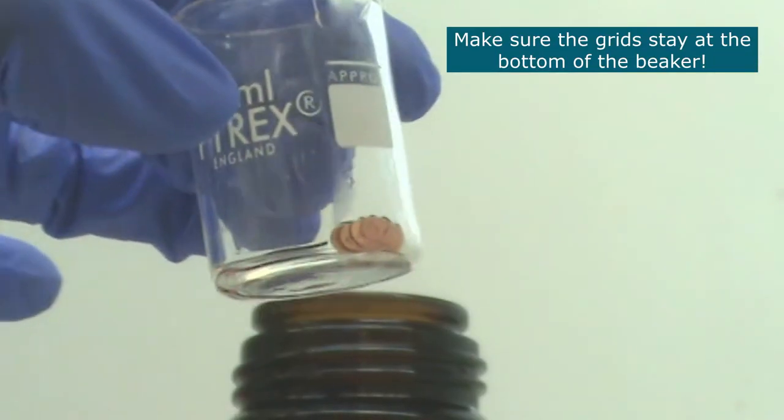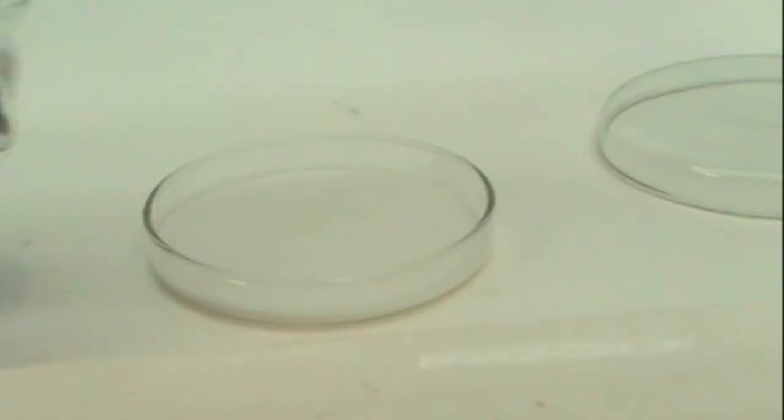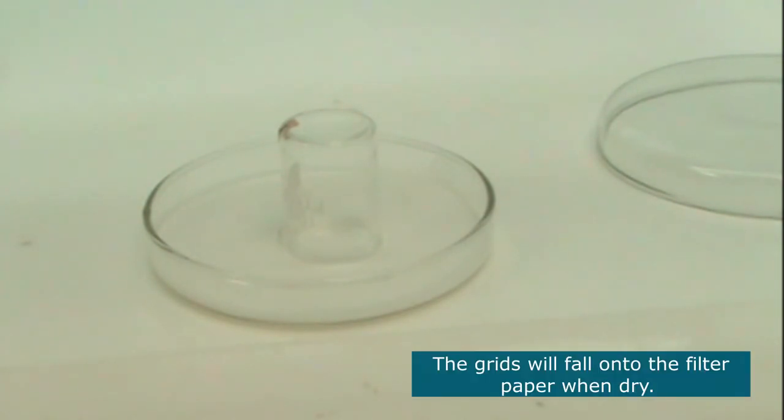Make sure the grids have stayed at the bottom of the beaker. Now invert the beaker onto the filter paper that's inside the petri dish and allow the grids to dry inside the fume hood. And when all the grids are dry, they will fall to the bottom onto the filter paper.